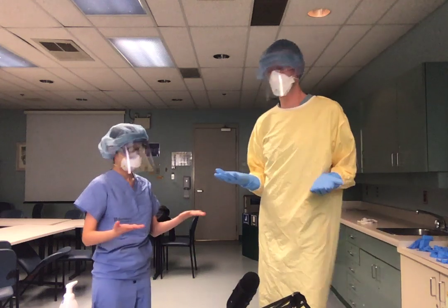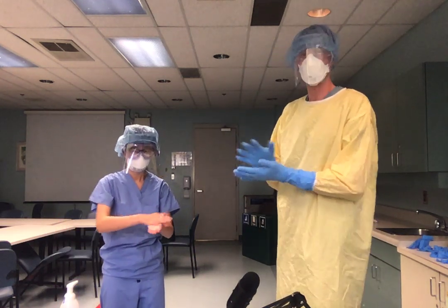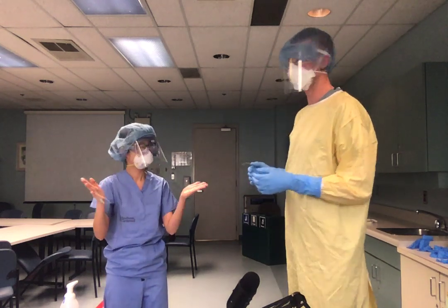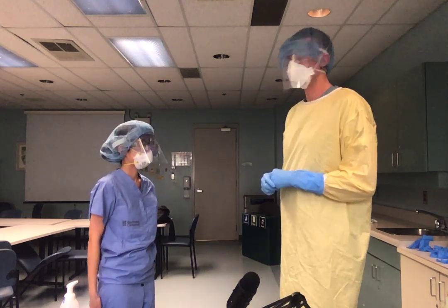Perfect. So we're going to wash our hands again. For the sake of this video, we're going to make it quick. She would be doing the full 7-part thing, but you just clap your hands to show that you've washed your hands properly. Okay, so now we're going to take off the bouffant.